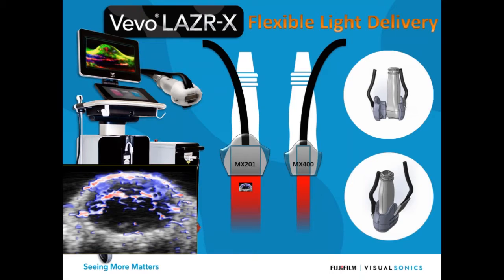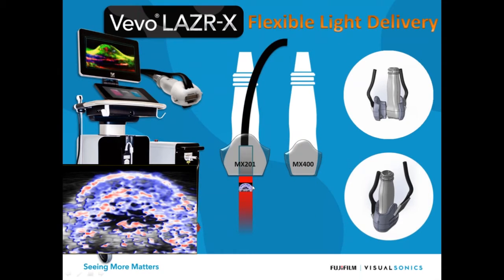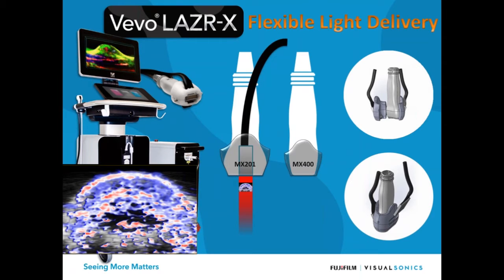I might get an image like this, but now the big change that we've made is that these fibers are actually interchangeable with the different jackets. So for example, instead of having my wide fiber that's designed for the 201, I can actually take the narrow fiber from my MX400, and now I've got the light focused in. I'm not throwing any of it away. I've focused the light in all on my target, and as a result I get better signal. Well, I'm kind of proud of that animation. I'll show that again. So this is the signal before, and now the signal after. We just get much better sensitivity, better depth, and since we're not even using the whole range of the transducer, this is a big advantage.